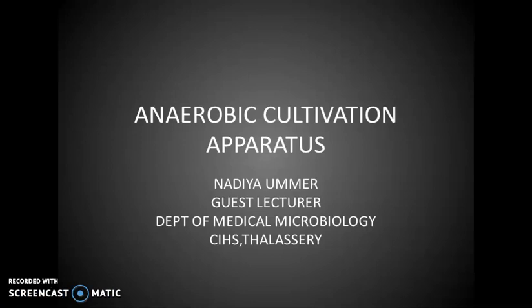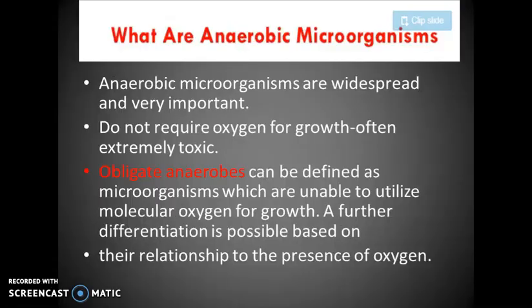So today in methodology we are going to discuss anaerobic cultivation apparatus. Before that, we can briefly describe anaerobes. So what are anaerobic microorganisms?